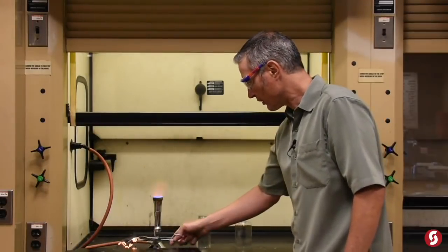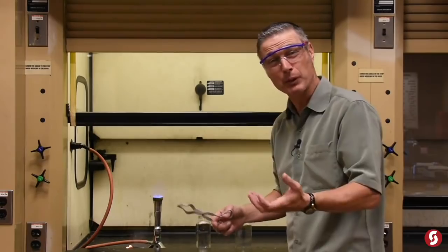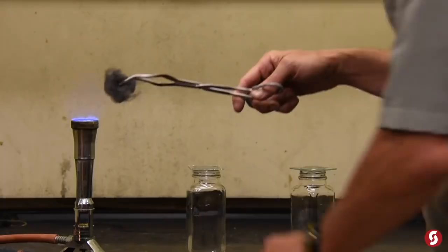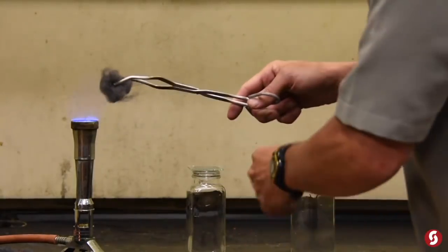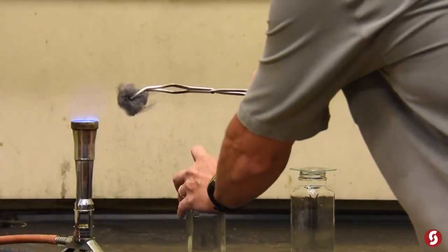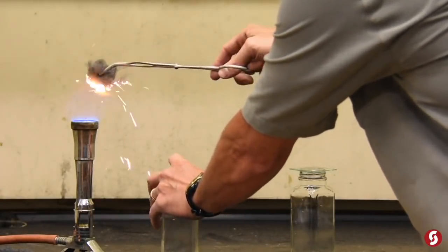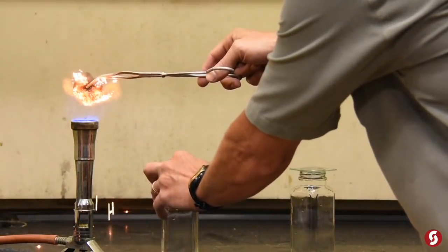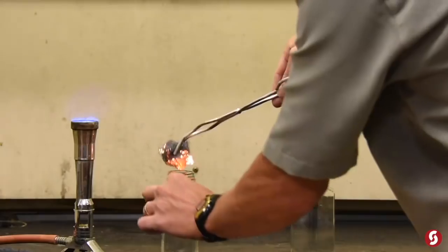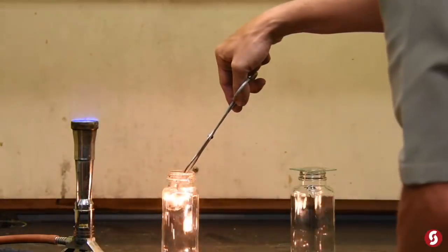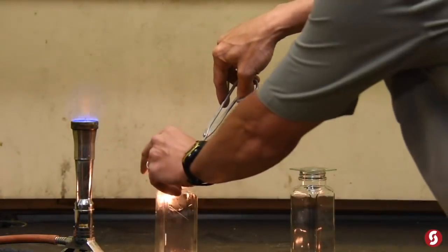Take another piece of steel wool and do the same thing, except this time I'm going to put it in the oxygen. There we go. Another piece of steel wool. I think steel wool, if I recall, is made from genetically modified sheep. And I would not wear a sweater of it.